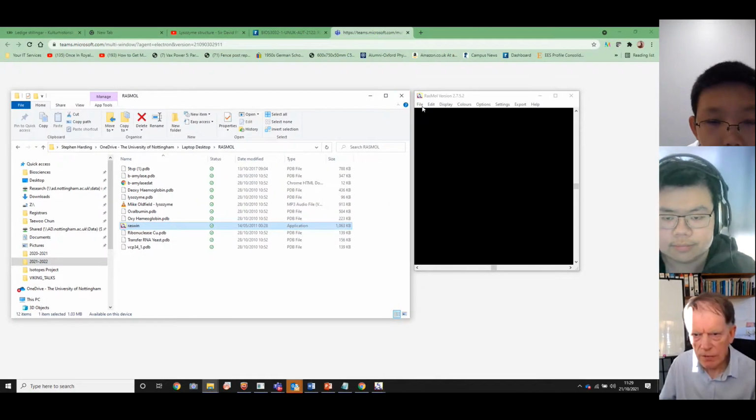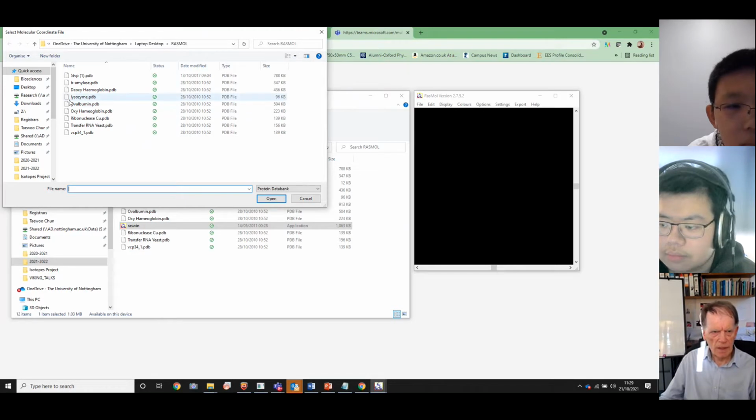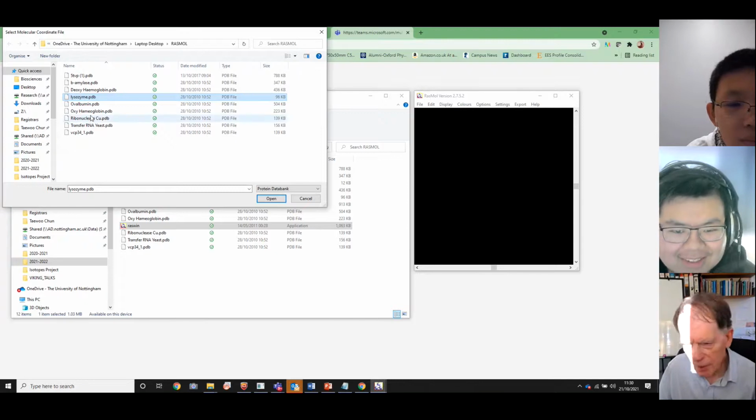So just go to File. You need to open a file in this folder. And since we've just seen the Lysozyme video with Sir David Phillips, we'll click on that. PDB, anyone knows what PDB stands for? No, not really. It stands for Protein Data Bank.